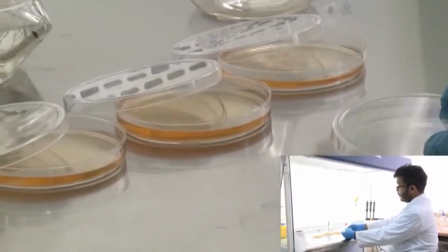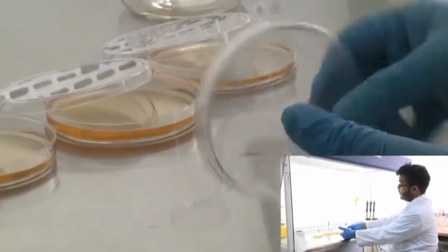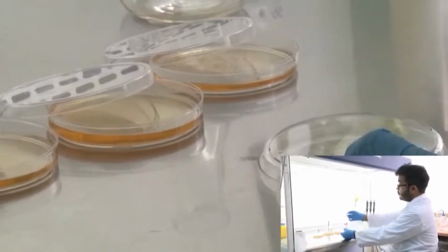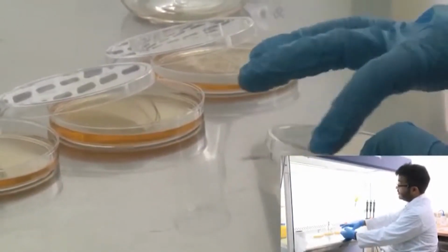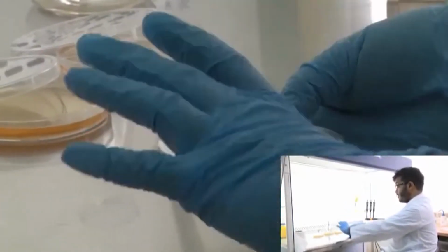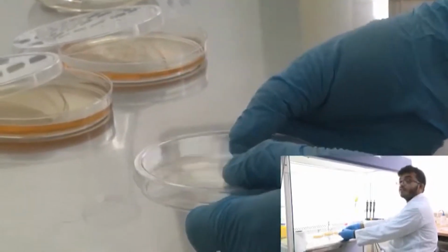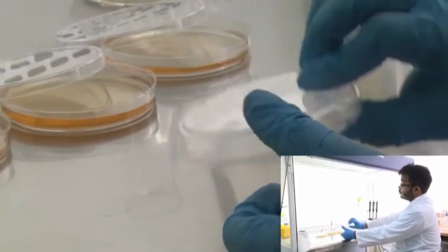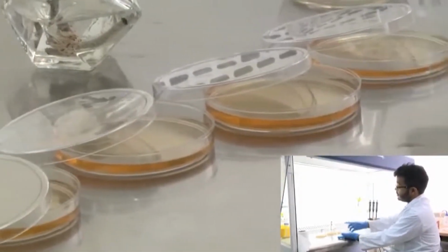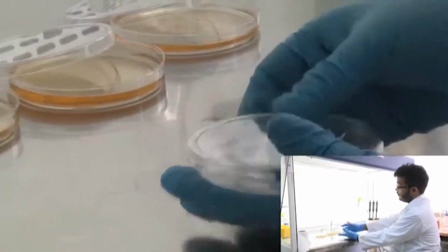Also, keep in mind that during storage, plates are always stored upside down and not like this, because otherwise the condensation that develops on the lid might fall onto the plate surface, the LB agar media surface, and make it watery and also hamper the bacterial growth, and so forth. So, normally when you store plates, the dish contains the media and you cover it like this.